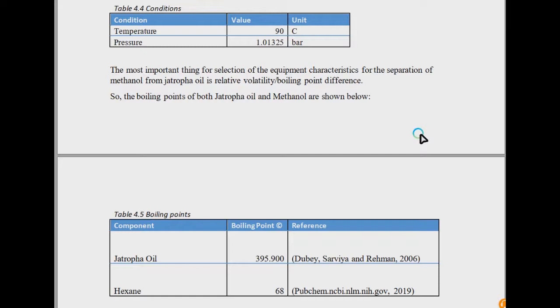But most of the time, it can break easily if you press it. It can handle only a certain pressure. So the solvent boiling or vapor pressure will provide enough pressure in a clean, neat way, because whatever comes out from that seed due to the vapor pressure of the solvent will be absorbed inside the solvent. So there is no problem about the loss of oil in solvent extraction.